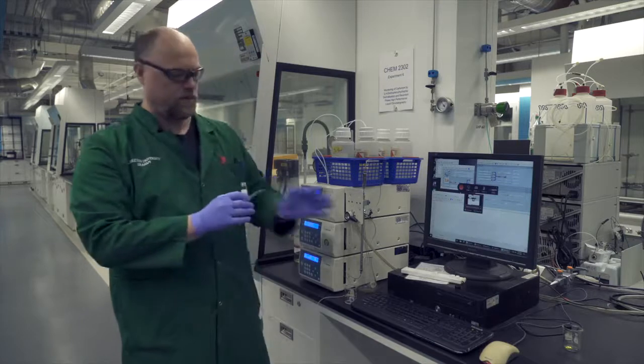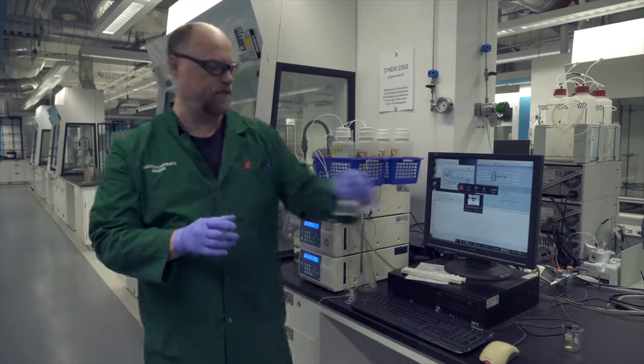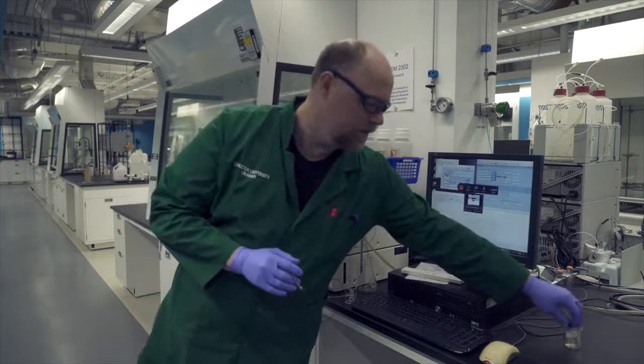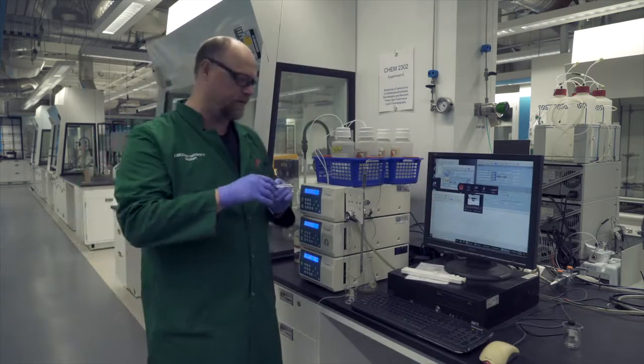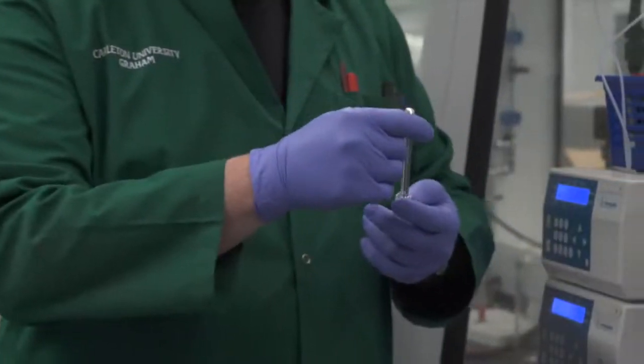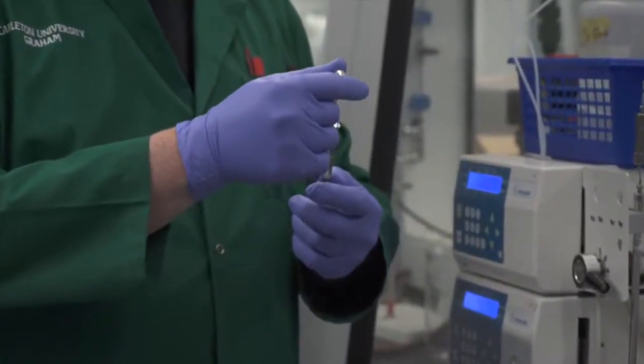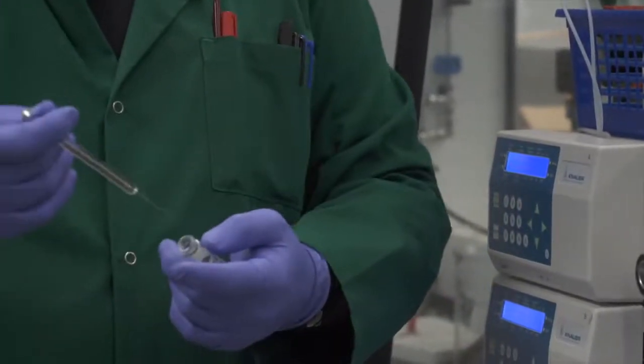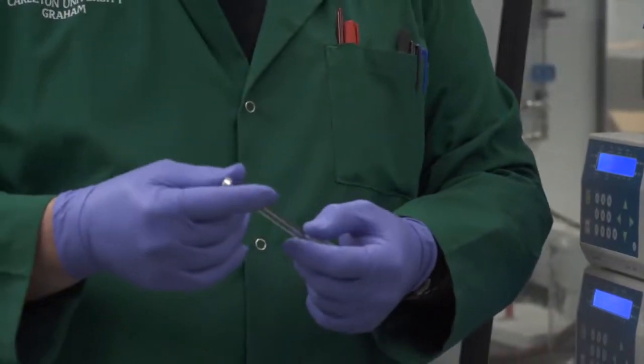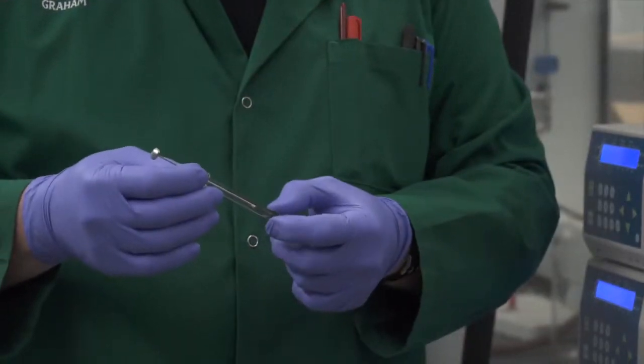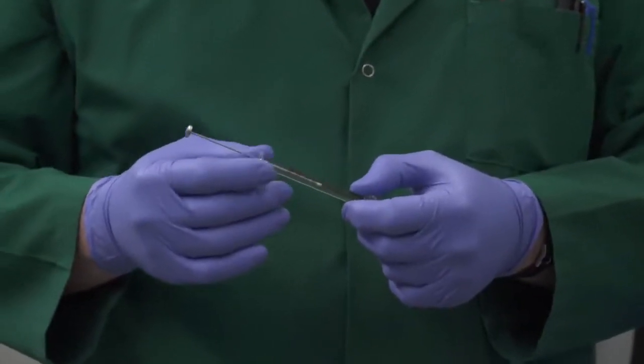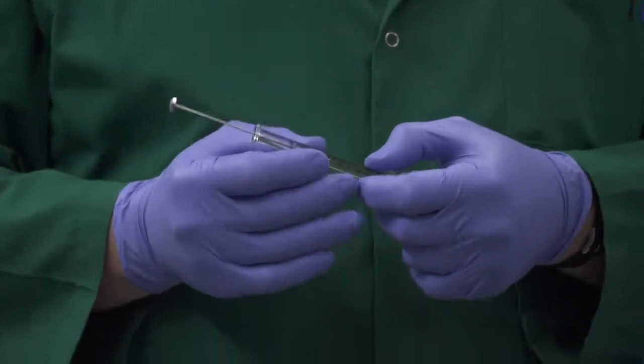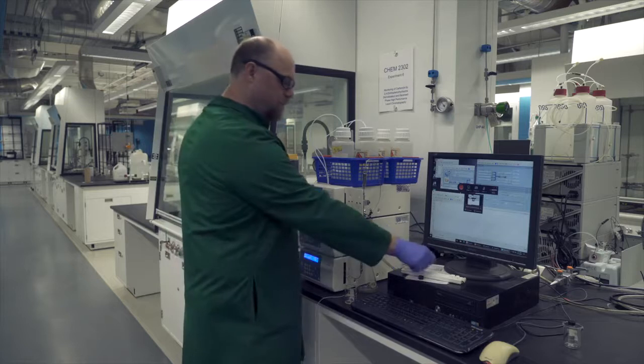Once the syringe has been rinsed with the solvent, the next thing you're going to want to do is to rinse it with the sample that you're going to use. This will remove any possible dilution effects that come from the solvent. Here you just need to rinse it probably about once is fine. Then what you're going to do is you're going to load the syringe with about 50 to 60 microliters of solution, and then that syringe will be ready for injection.